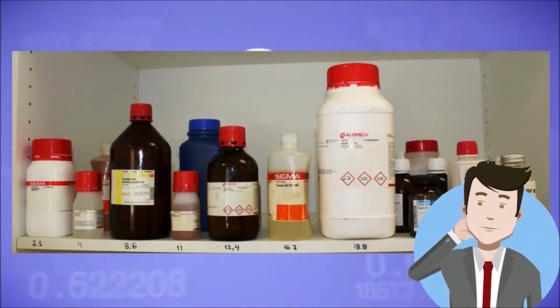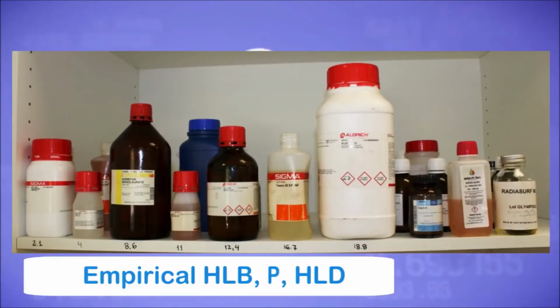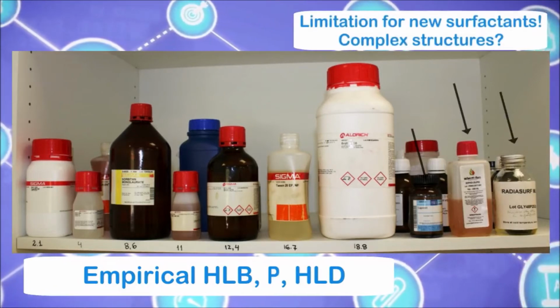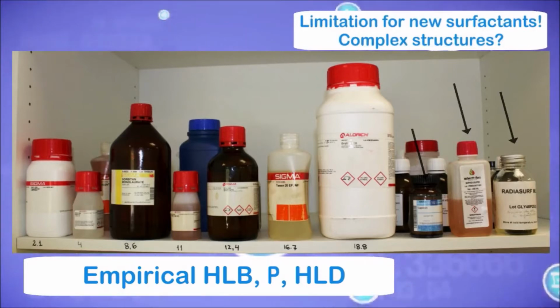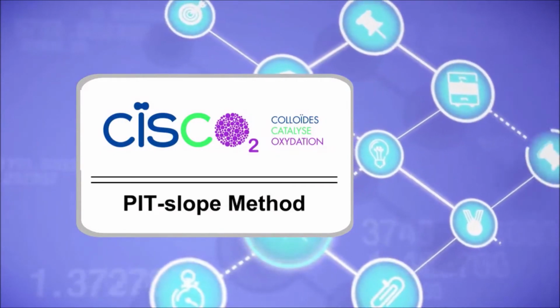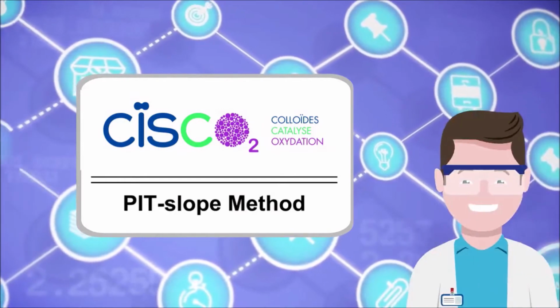Why do we need another method? For most cosmetic surfactant mixtures, these methods are difficult to use: the molecular structure is not precisely known, or the empirical experimental determination is extremely time-consuming. That's why the Cisco team developed the PIT slope, a new simple method to characterize surfactants and determine their hydrophilicity through a temperature screening.